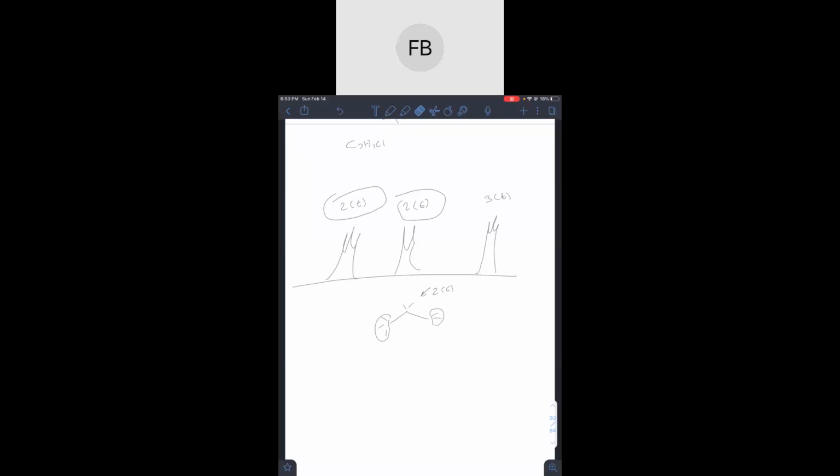Perfect. Now what? By process of elimination, the one on the very end that is not a methyl has to have a Cl on it, otherwise it misses the octet rule. Because there's a Cl left in our molecular formula, the Cl must be right there, because it's the only one with a broken octet.